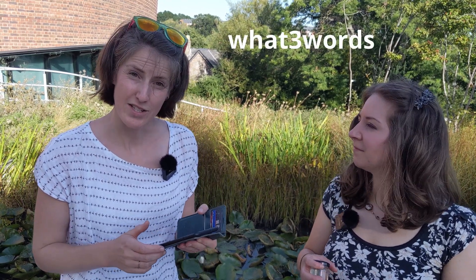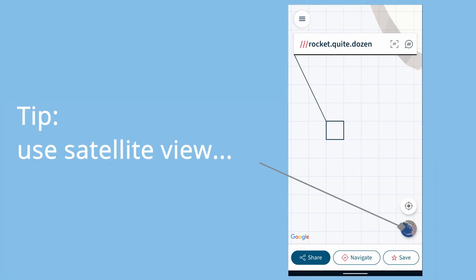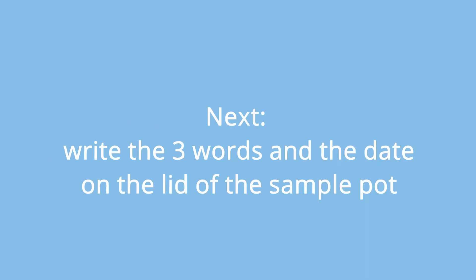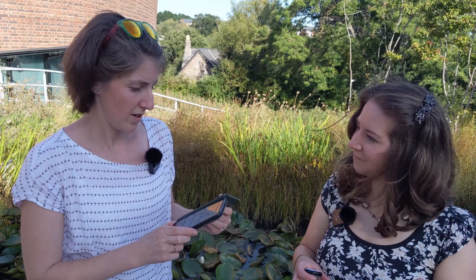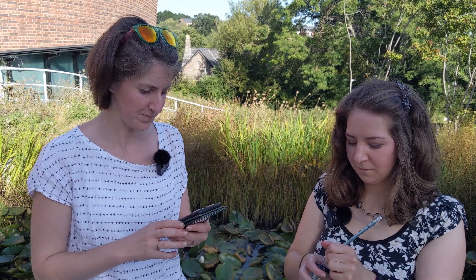The research team needs to know exactly where you collected your sample from. The best way to do that is to open up an app called What3Words, navigate to where you are, and it can pinpoint your location to within a three metre square. The words for our location here are rocket.quite.dozen. Write down the date you took the sample, and then you're ready to register your sample online.